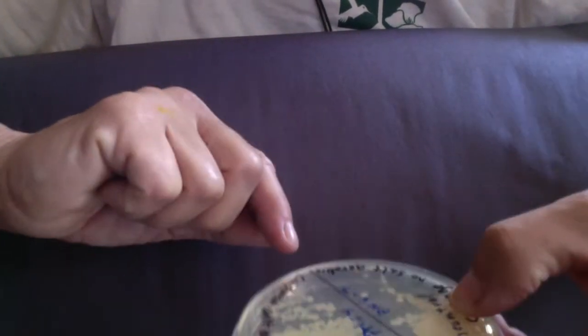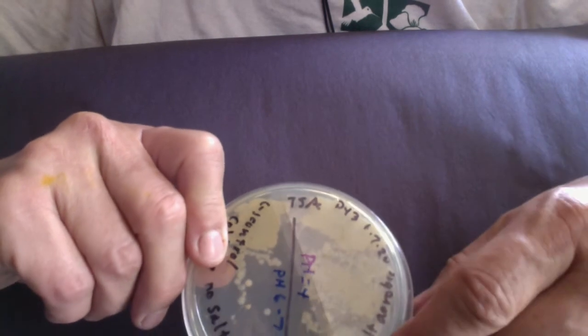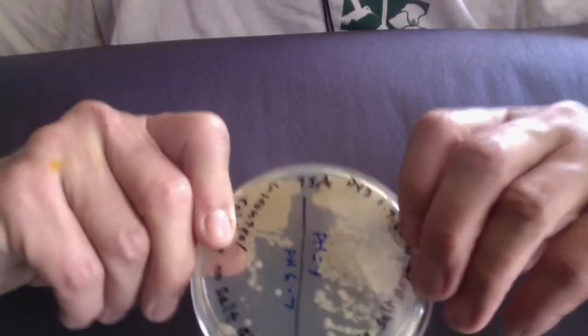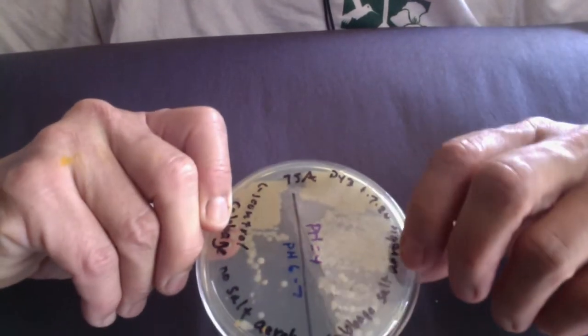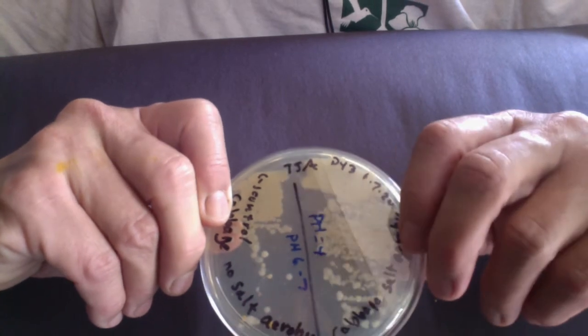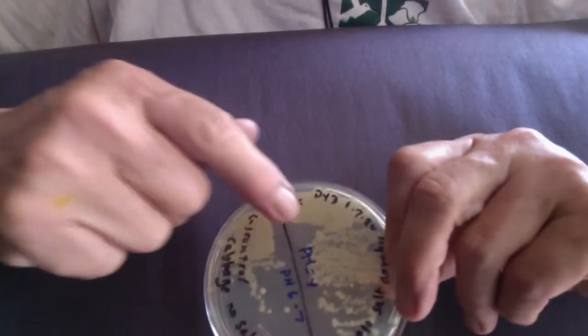But I do have our day three TSA plates to show you. This would have been after 48 hours of incubation. So this was our negative control — no salt, aerobic. And over here, this was 48 hours in the cabbage plus salt aerobic. The negative control cabbage with no salt had a pH of 6.7, and the cabbage with salt aerobic was pH 4. So I think we did indeed have some lactic acid fermentation going on with the cabbage and salt, indicated by the drop in pH — or at least we're presuming it's lactic acid fermentation.